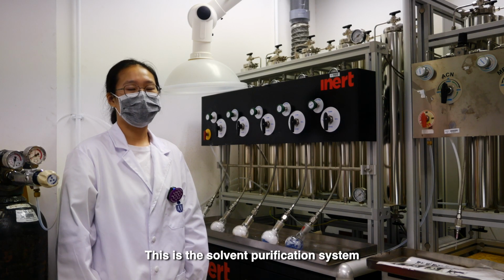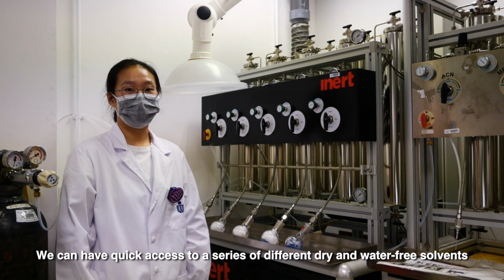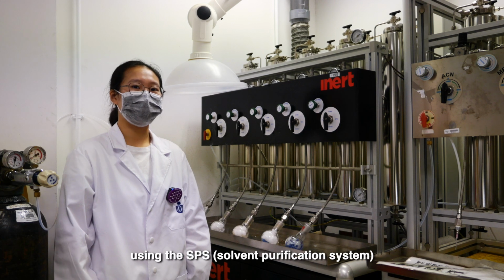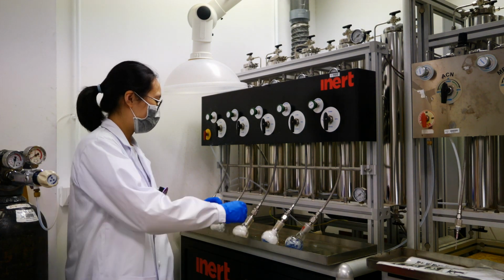This is the solvent purification system. We can have quick access to a series of different dry and water-free solvents using an SPS. Let me show you how to get solvents from the system.